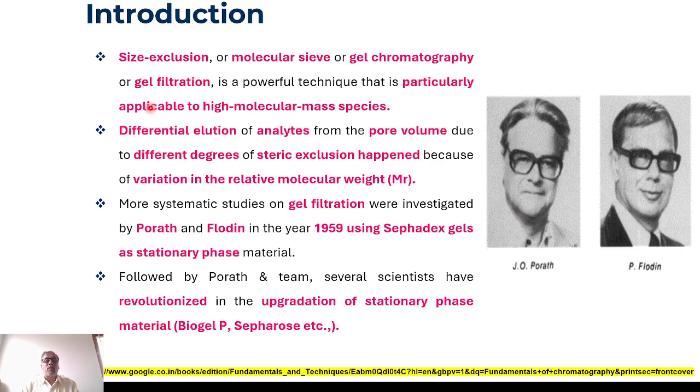We can easily purify or separate them by effectively implementing this technique. The simple overview of this technique is that you can elute different molecules based upon different degrees of steric exclusion, which is done with the help of your gels.